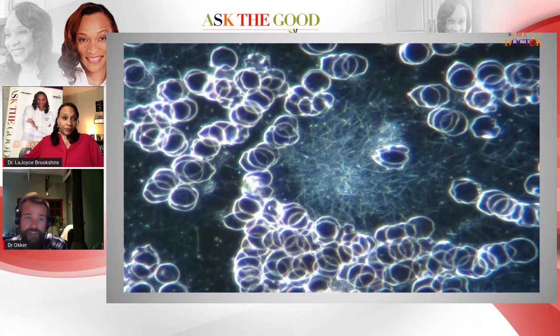So any sort of damage, any oxidative stress, the red cells are not really able to repair themselves like other cells. So we're actually able to get a very clear picture of a person's oxidative stress over a period of time simply by looking at the shapes of the red blood cells. So in this image, we can see not all the red cells are nice and round. In a normal sample, all the red cells should be nice and round, and we shouldn't get any of these unusual shapes here. So quite a few irregular shapes visible here. Those are red blood cells that have been damaged by oxidative stress. So there's cell membrane damage as a result of toxins that a person has been exposed to.